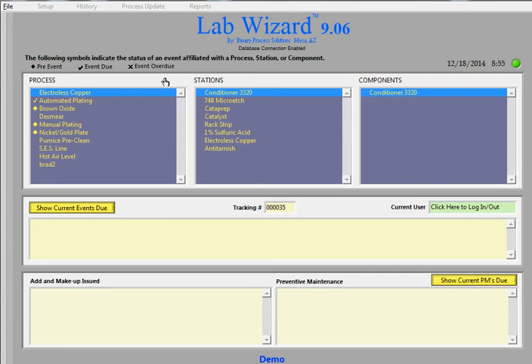Hi, this is Brad, just doing a quick LabWizard walkthrough. LabWizard is a chemical plating line bath management software which will give you precise triggering events for technicians to analyze the chemicals in your production process.